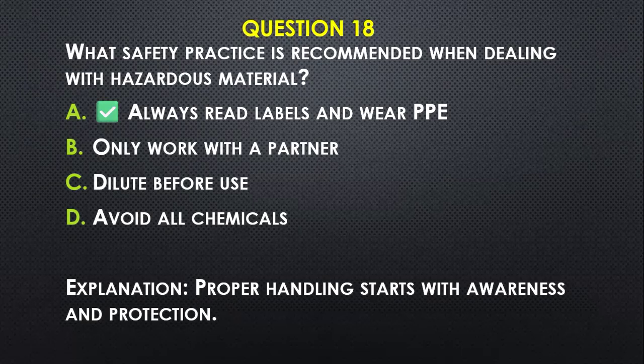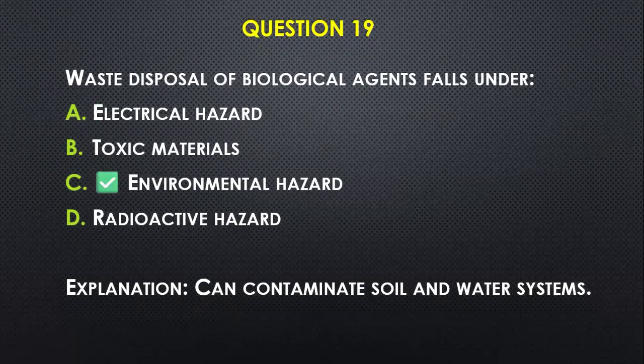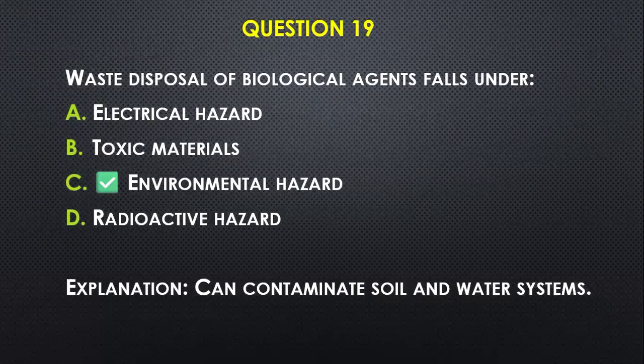Question number nineteen: Waste disposal of biological agents falls under — A) electrical hazard, B) toxic material, C) environmental hazard, D) radioactive hazard. C — environmental hazard — because those things you are disposing of carelessly can contaminate the soil as well as the water system.